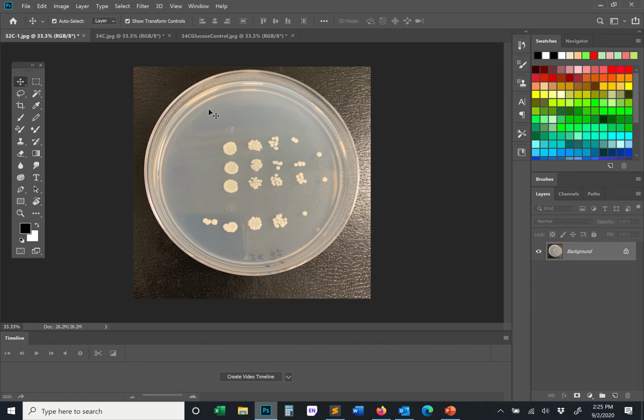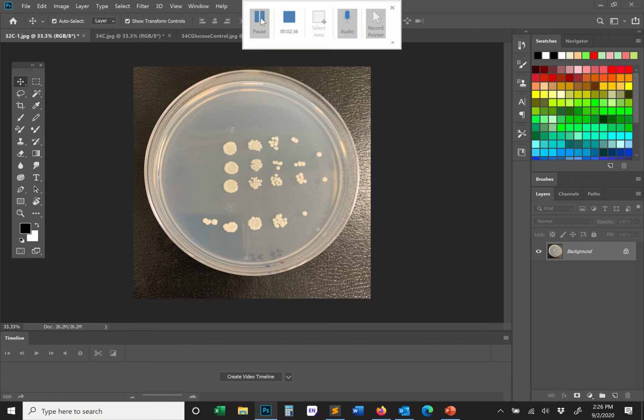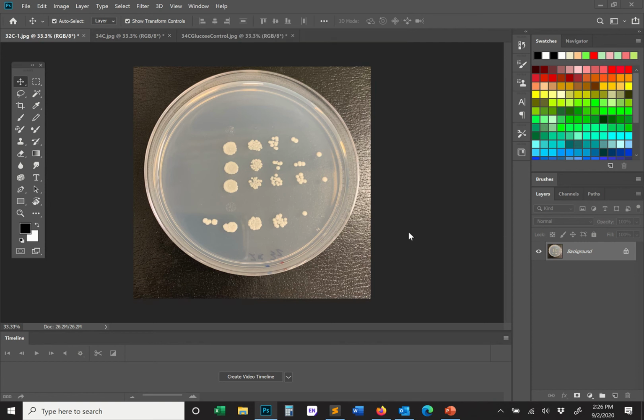This is one reason why I show them, because you're never going to produce a figure that's better than the images that you have to start with. So your first goal should be trying to get better images than things like this. You should really look at your images with a critical eye and try multiple times over and over to change the settings such that you can acquire more accurate images. But needless to say, I think these images were probably taken quickly.